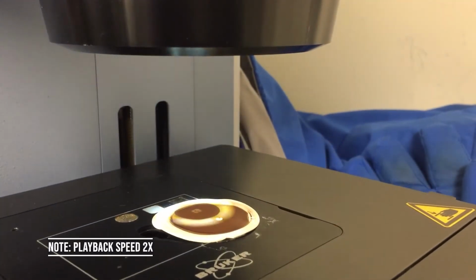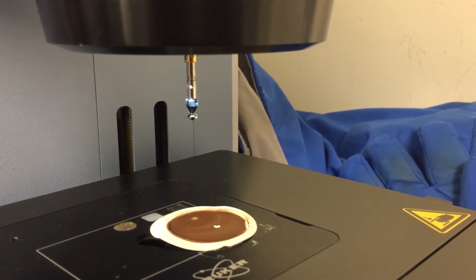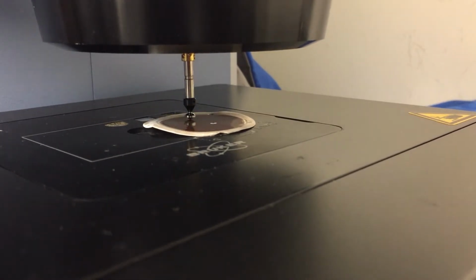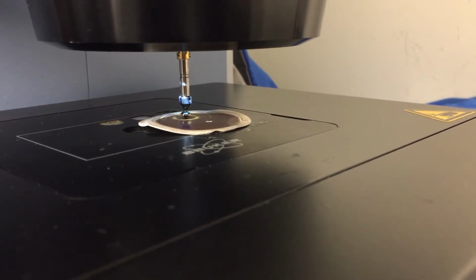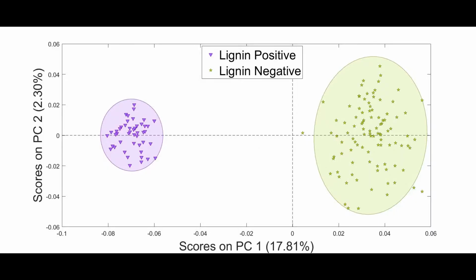The Bruker-Lumos FTIR microscope allows for chemical mapping of samples using ATR, specular reflection, or transmission mode. It has a germanium ATR crystal with a 120 micron diameter tip. The collection area can be apertured down to collect data from smaller areas. The CNS staff can also assist in advanced spectral data analysis, like the principal component analysis of FTIR data.